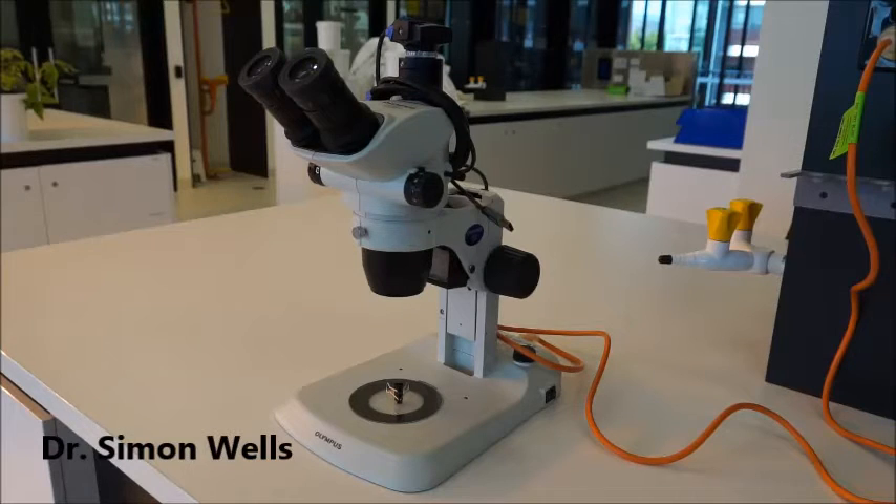These are delicate precision instruments and they're quite expensive, so it's important to take care of the microscopes in the lab. With the proper care they should last something like 30 or 40 years. They are used by a lot of different students — they're communal tools — so it's everybody's responsibility to take care of the microscopes to make sure they're in nice working order.